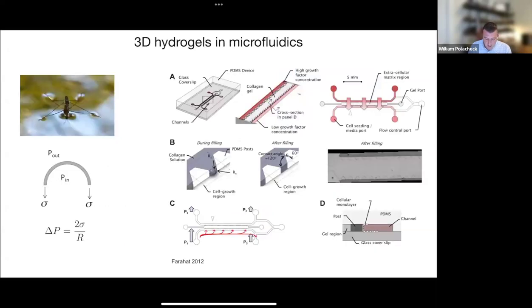So that, in a very clever way, has been leveraged originally by Noo Li Jeon and Roger Kamm to constrain hydrogels into specific regions within a microfluidic device. So the way you can introduce a hydrogel into a microfluidic device is you go through that process of photolithography and soft lithography, like I just went over in the previous slide.